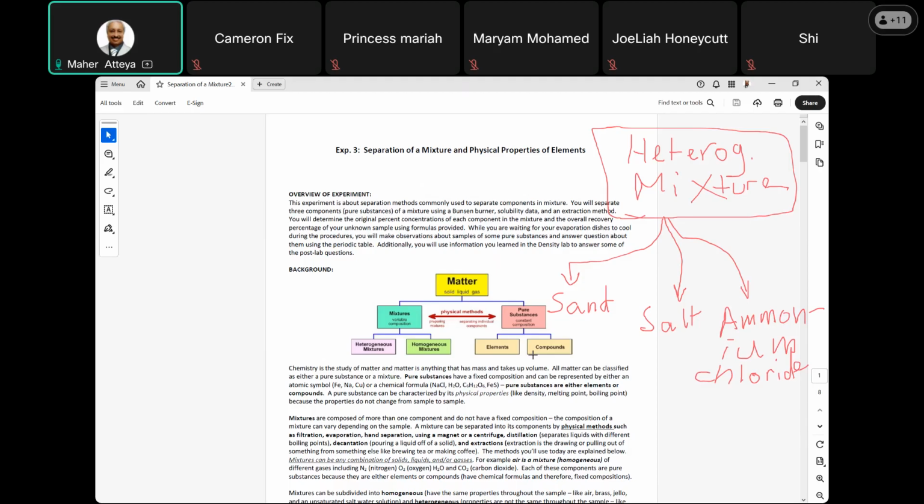Okay, so we have to separate sand by itself, salt by itself, ammonium chloride by itself, and determine the percentage of each of those present. Because you are not doing the actual experiment, you can use the data I gave you. I'll explain how to separate those.